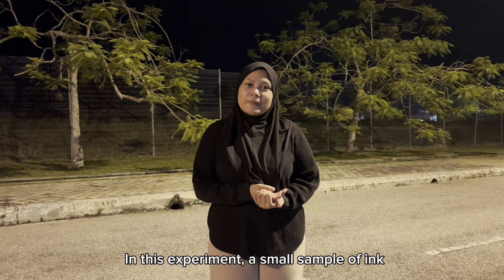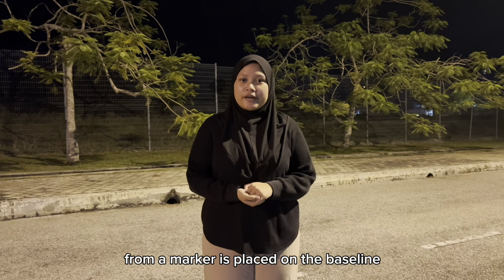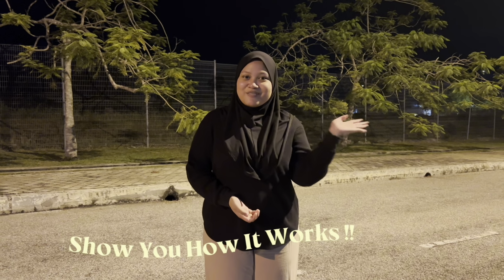In this experiment, a small sample of ink from a marker is placed on the baseline. The solvent acts as a mobile phase and moves upward through the stationary phase. Let me show you how it works.